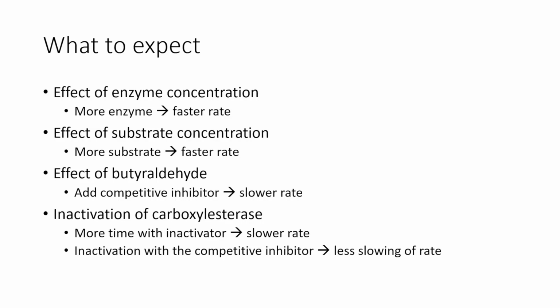So that brings us to our last component that we're measuring, which is the inactivation of carboxylesterase. So the more time the inactivator spends with the enzyme, the slower the reaction rate will be, because as the inactivator interacts with the enzyme, it is inactivated. So it cannot catalyze reaction, and so it's essentially like you've taken away potential enzymes, so you get a slower possible reaction rate.